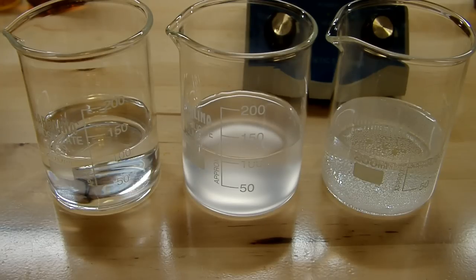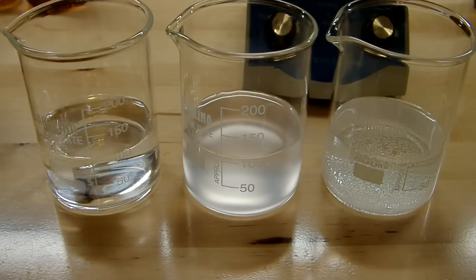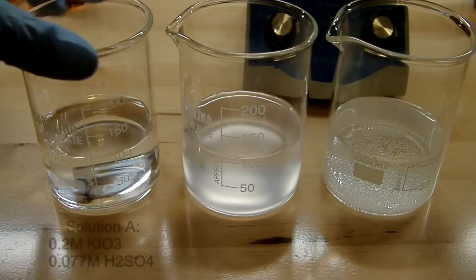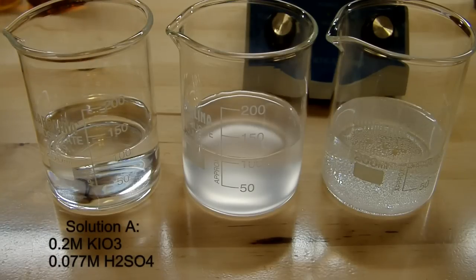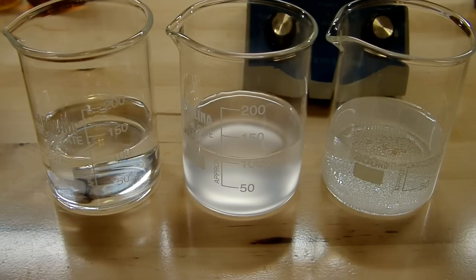This involves three separate solutions that I've already made here. I didn't film me actually making them so you just have to take my word for it that this is what they are. Solution A on the left here is 0.2 molar in potassium iodate and 0.077 molar in sulfuric acid.